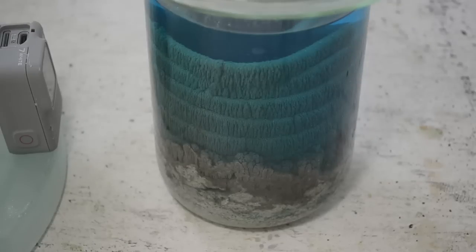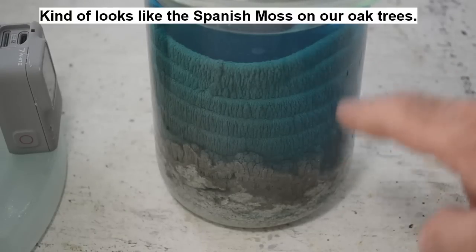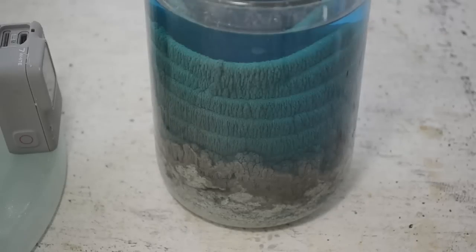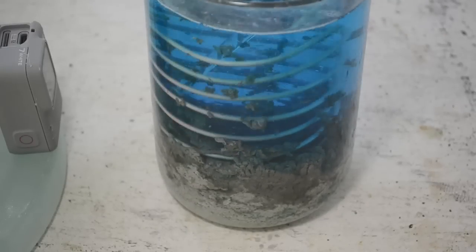Okay, so we're about 3 hours in and things have changed again. We've got these long beard-like stalagmites sticking down from the coil now. So you get these changes as the concentration of the silver nitrate in the solution changes. Just the way it cements out over time differs. The color has lightened up again, so I'm going to shake the silver off the coil again.